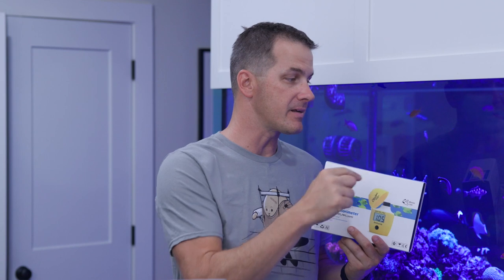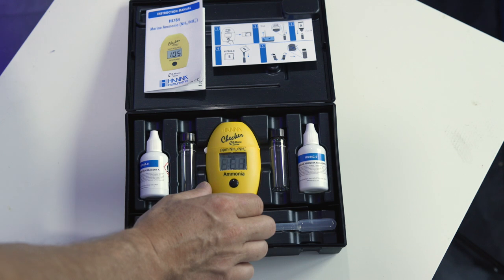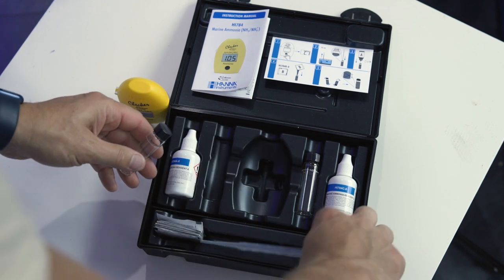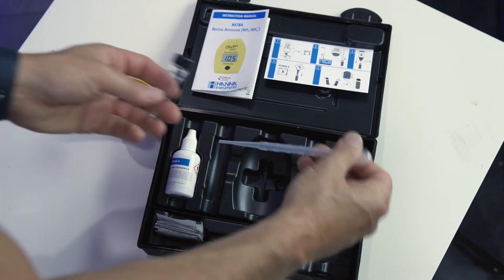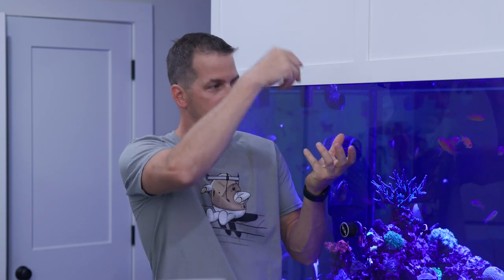Let's run an ammonia test on my display tank for the first time ever and see what readings we get. Opening up the box — I like that there is a quick reference card for instructions. They're easy to follow and it's laminated so it can get wet, like when you knock over the vial. I also like how Hanna includes a dropper, as this makes getting the sample water from your tank easy. You can take the vial and dip it in your tank, but you're probably going to overshoot or undershoot the line. The dropper lets you add drops until you're right at that line with no need to dry the vial.